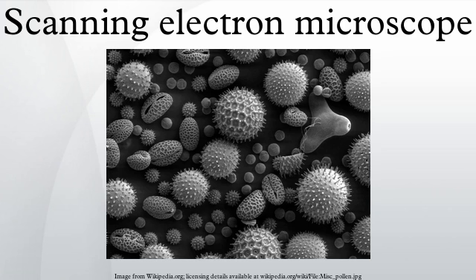chamber. The amplified electrical signal output by the photomultiplier is displayed as a two-dimensional intensity distribution that can be viewed and photographed on an analog video display, or subjected to analog to digital conversion and displayed and saved as a digital image. This process relies on a raster scan primary beam. The brightness of the signal depends on the number of secondary electrons reaching the detector.